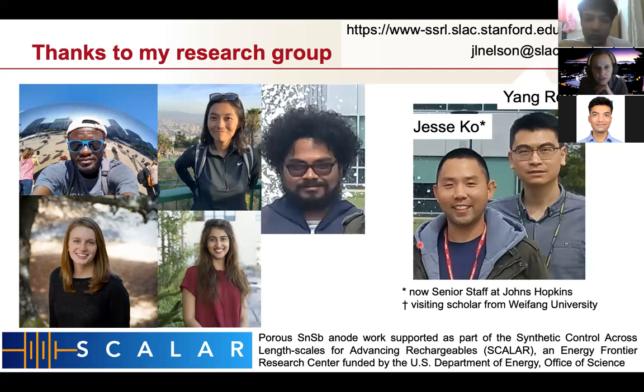Is the lithiation of lithium cobalt oxide forming cobalt particles reversible? We do have data on that, and I think we have data on pushing it all the way to 2.5 lithium, and then retrieving that. It was somewhat reversible, but it was forming other cobalt species which we couldn't identify, so we never published that data.